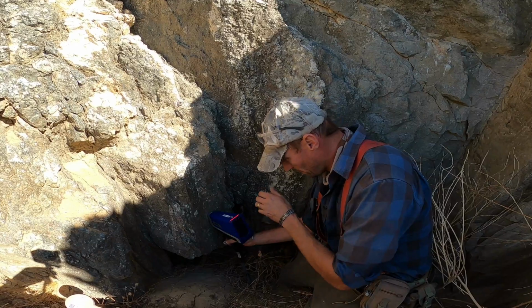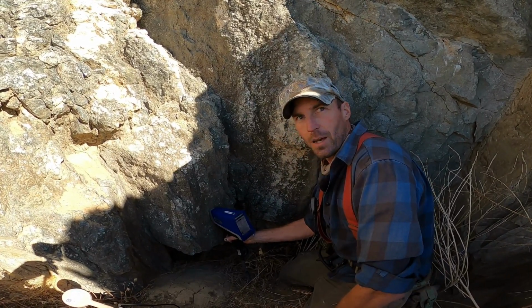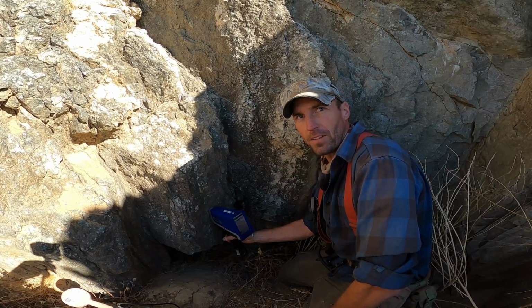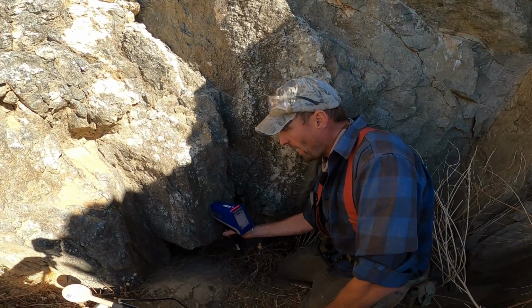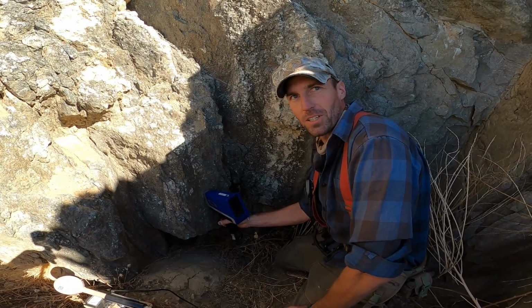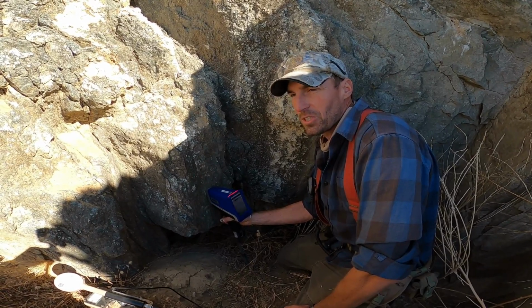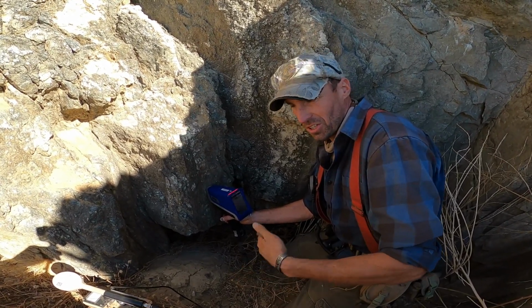Yeah, definitely. So I've got the first and third beam set at like 30 seconds. I don't need that much fidelity because I'm going to send it in for an assay. I just want to know right off the bat, because every time I pull the trigger, it's a minute and 30 seconds of my life sitting here enjoying the wonderful outdoors. But after about 200 times, it gets kind of old, so you want to start going faster.